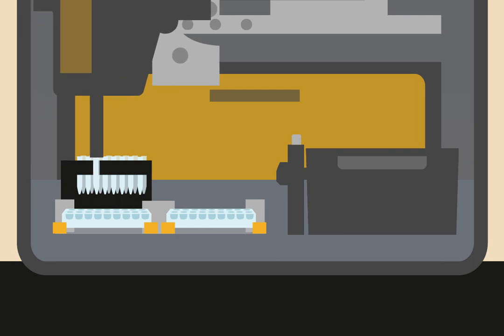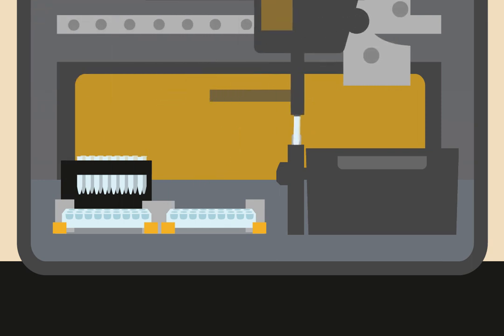The Prep can have up to two independent channels and a multi-probed head for bulk pipetting.